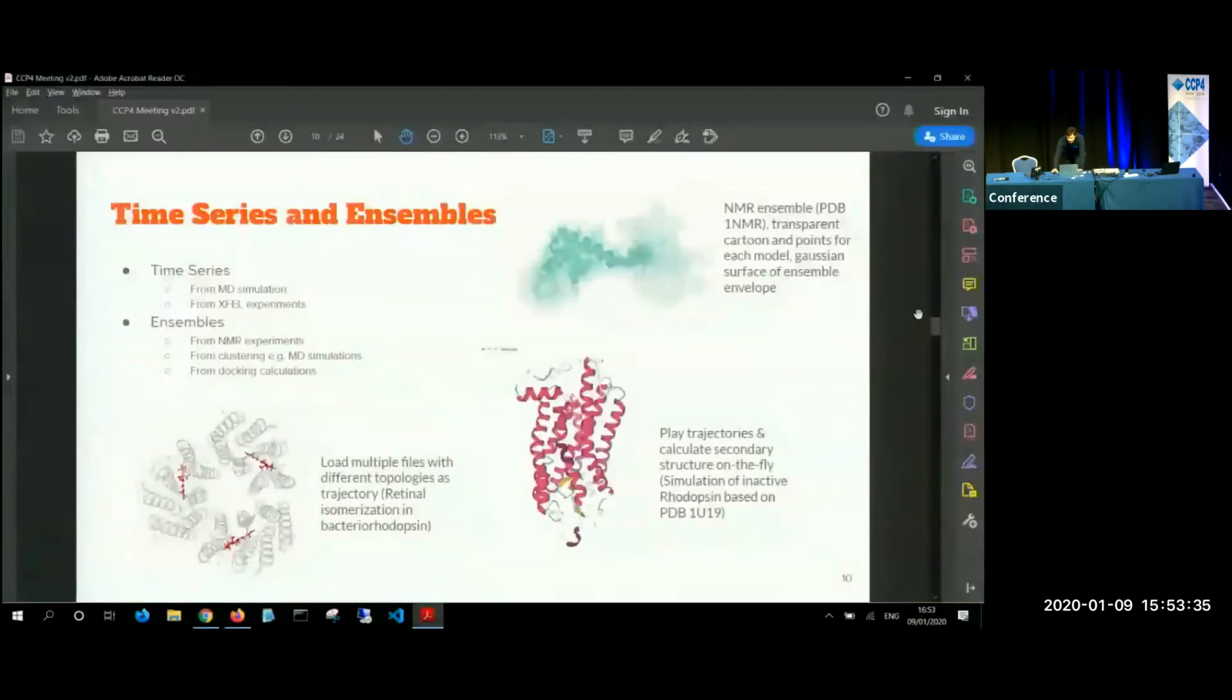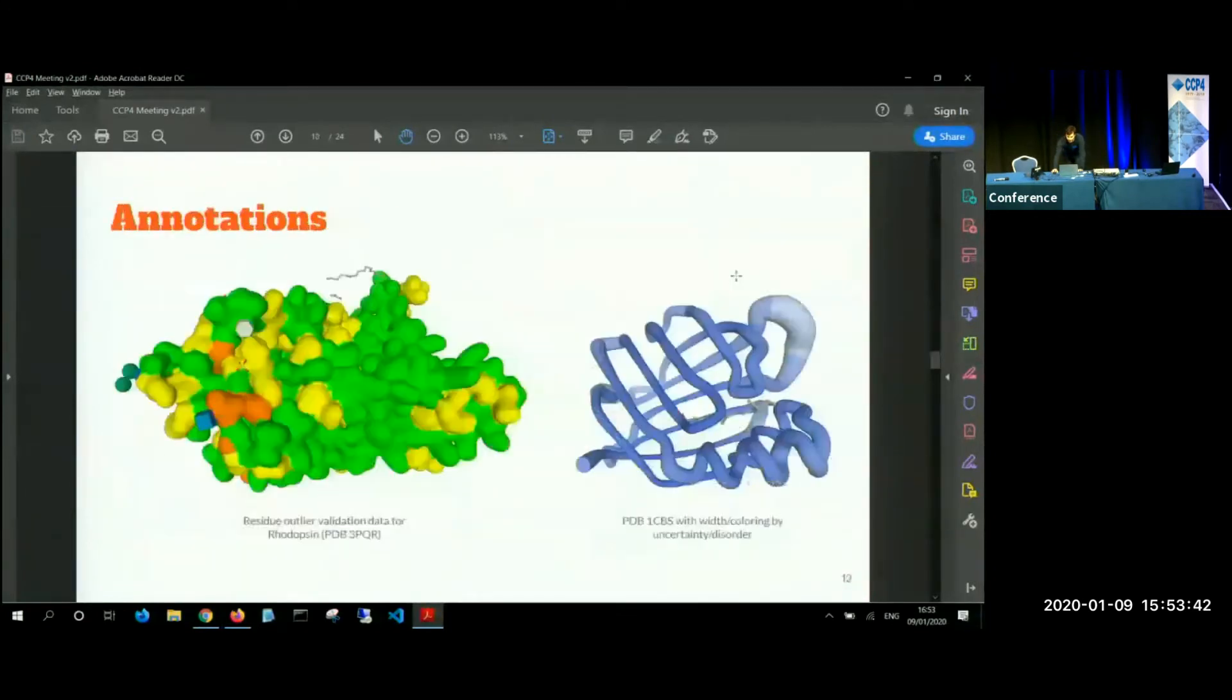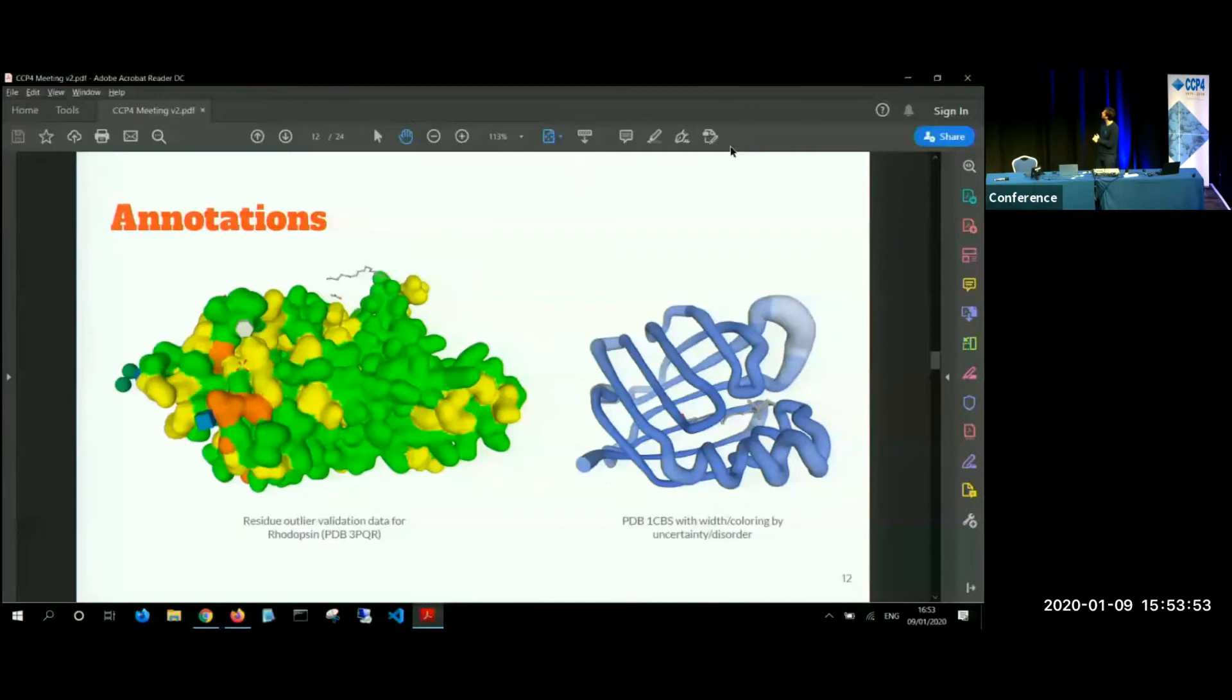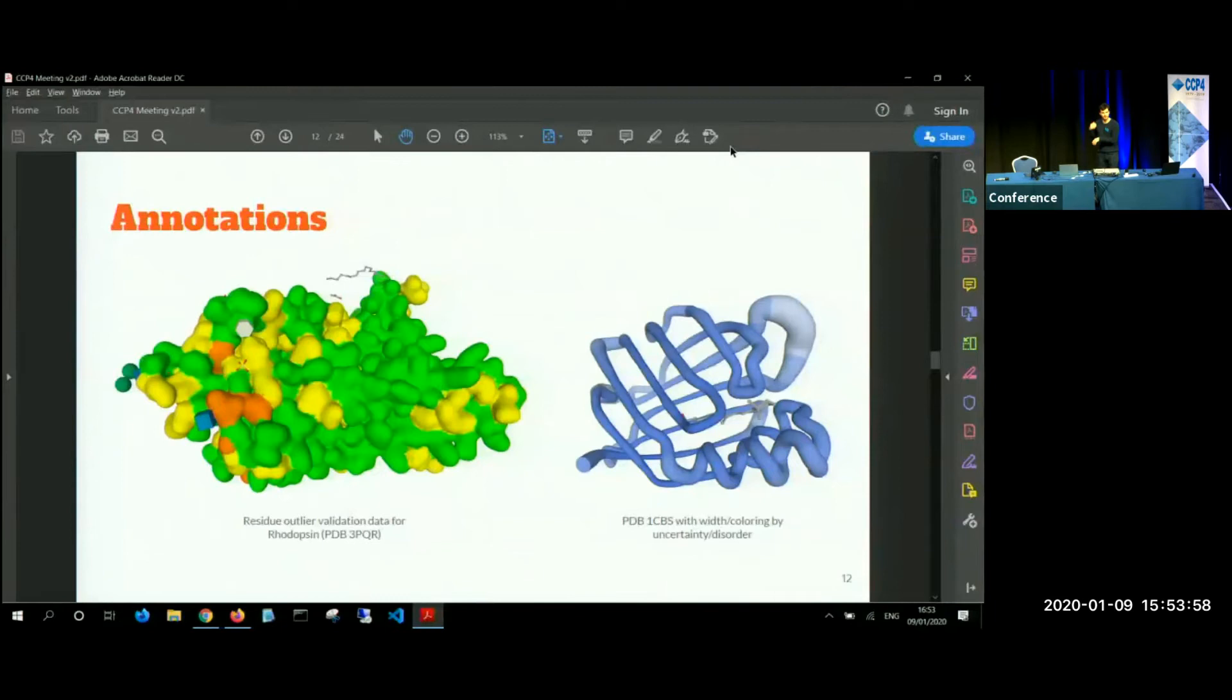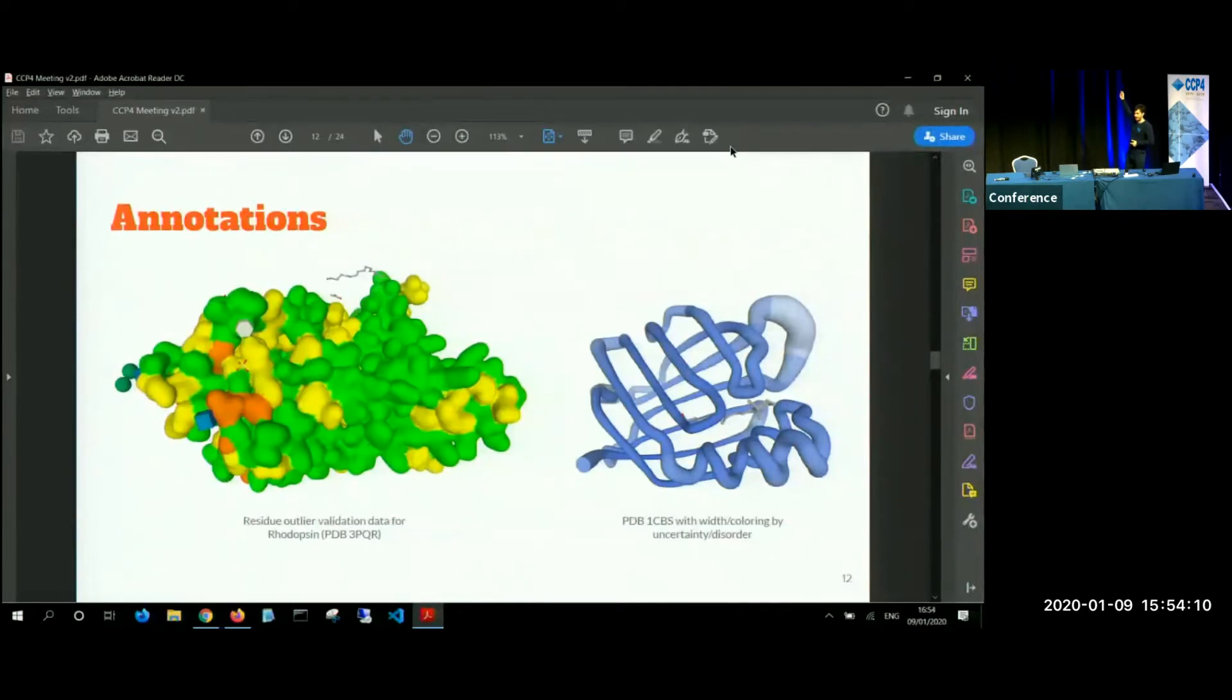Yes, there are just different types of visualization. We try to make it very pretty for the user. And I think would be annotations. For example, we have seen a lot of validation data presented. So here we, it will be residue other outlier validation for rhodopsin, which will be projected directly on the surface, which is much interesting way of presenting the information to the user than just showing a PDF document. And again, this would be interactive or we can show uncertainty along the chain with varying width and coloring it.